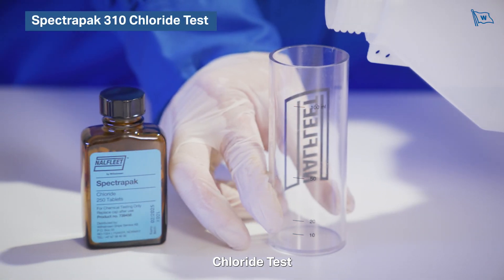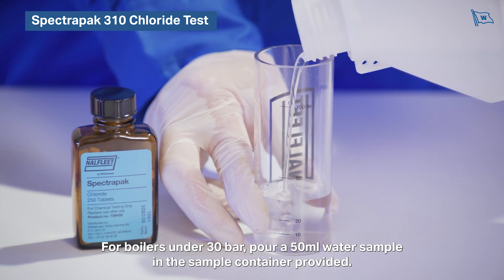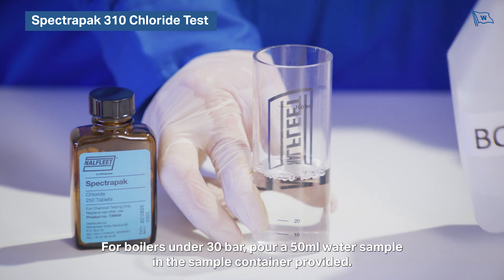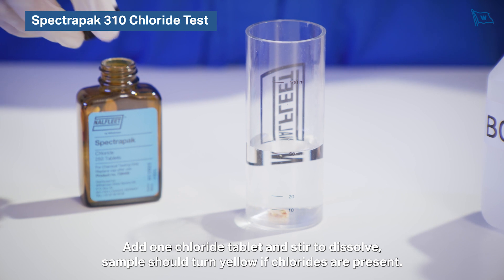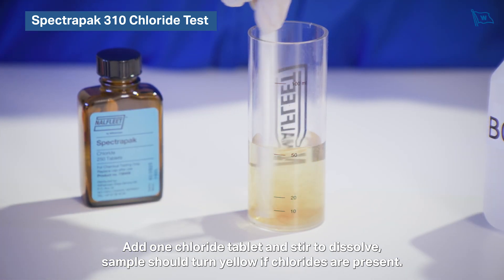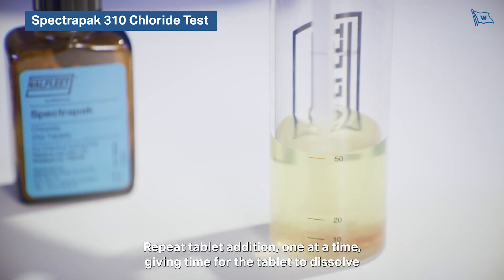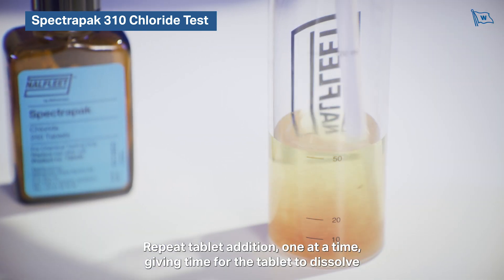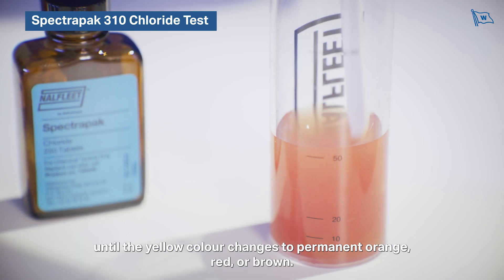Chloride test. For boilers under 30 bar, pour a 50 milliliter water sample in the sample container provided. Add one chloride tablet and stir to dissolve. The sample should turn yellow if chlorides are present. Repeat tablet addition one at a time, giving time for the tablet to dissolve, until the yellow colour changes to permanent orange, red, or brown.